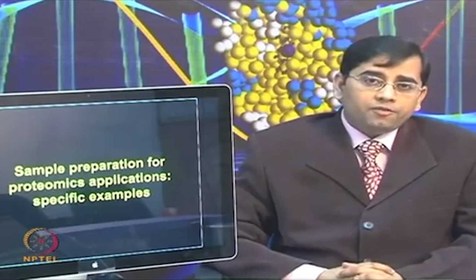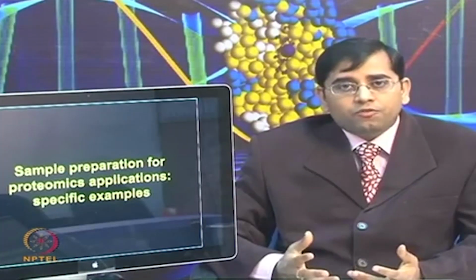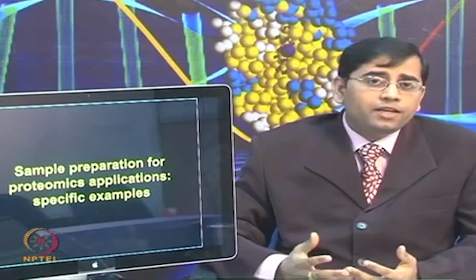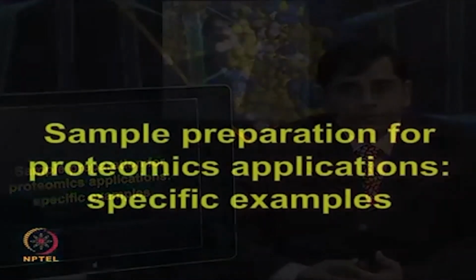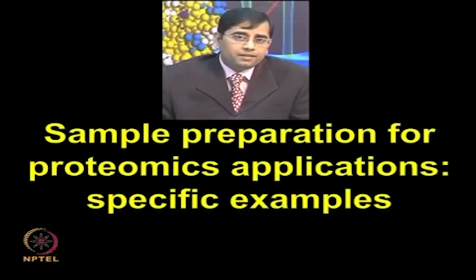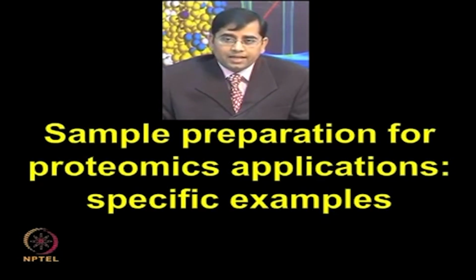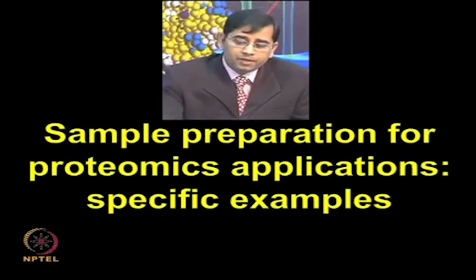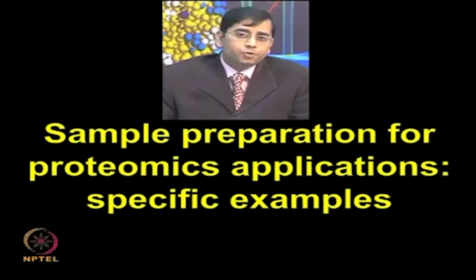So, we have so far covered different strategies of preparing a very good sample for proteomic applications. Now, let us try to apply some of this knowledge to various specific applications, such as serum proteome analysis and bacterial proteome analysis.